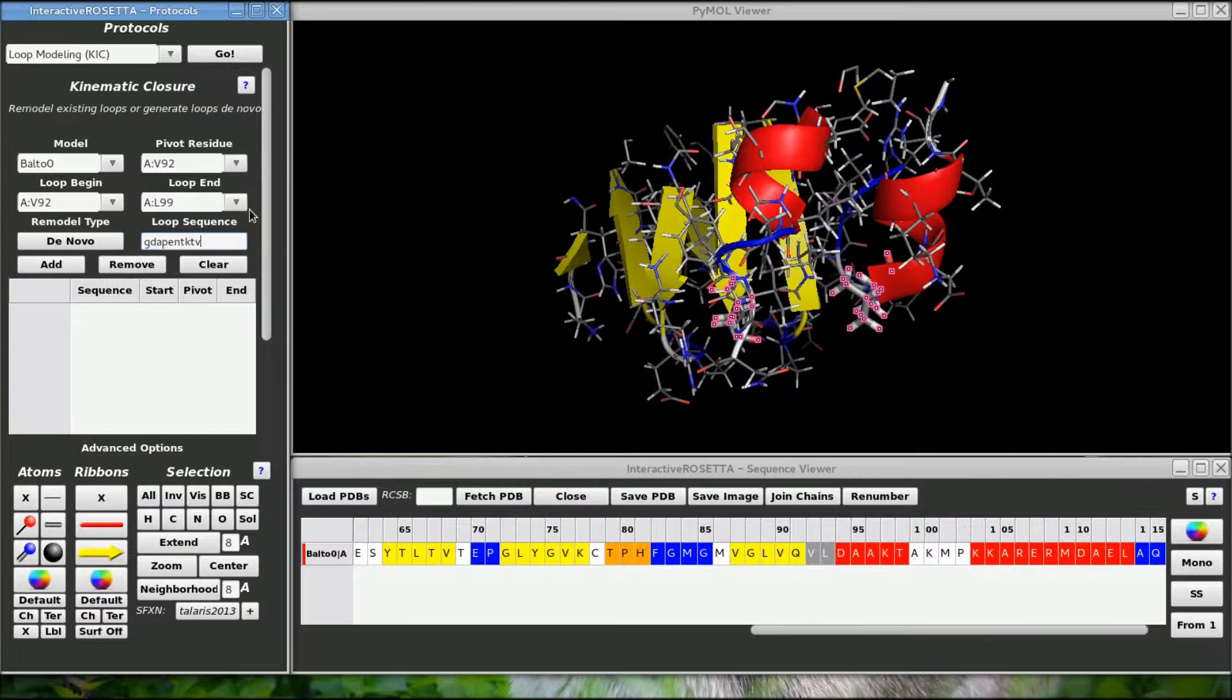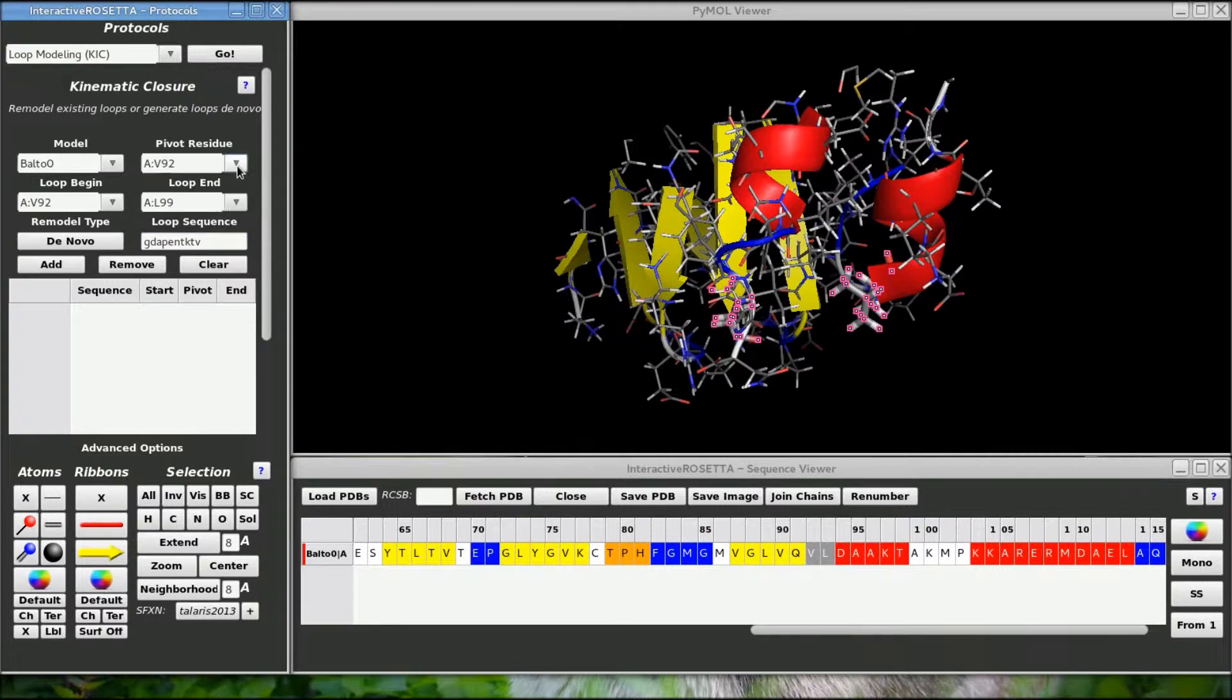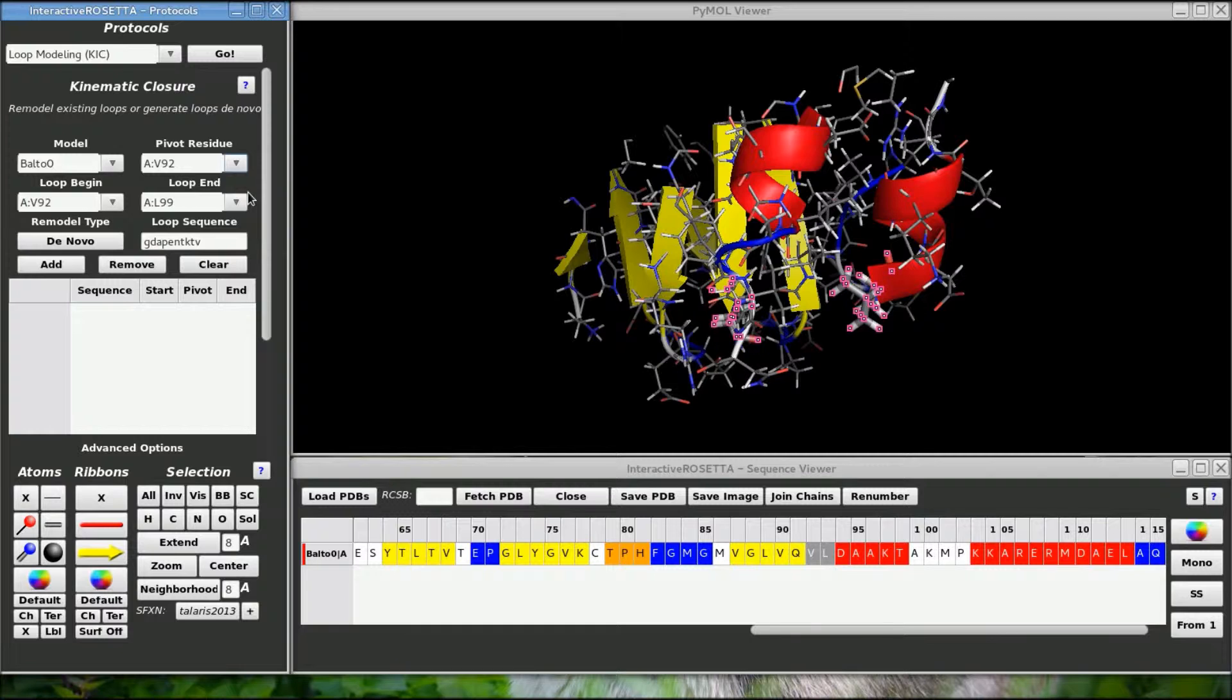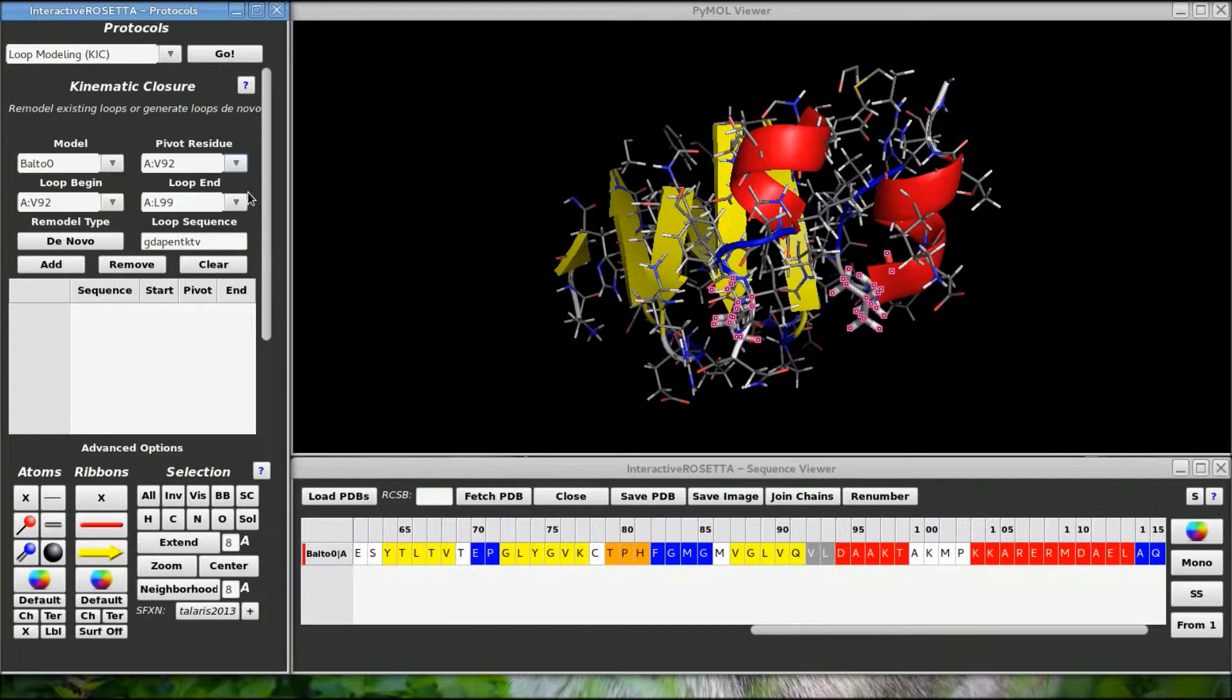You cannot use a unique pivot residue for de novo loops, but for refining or reconstructing loops you can specify a distinct residue to act as the pivot. The pivot point will be a breakpoint along the loop such that the loop in between the pivot and the terminal residues will move but the pivot will stay fixed. You can imagine the pivot as the elbow on a robotic arm.